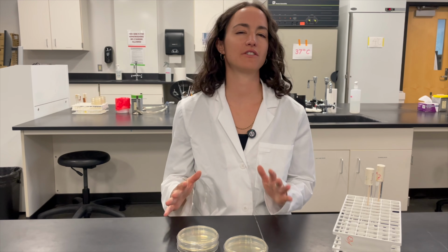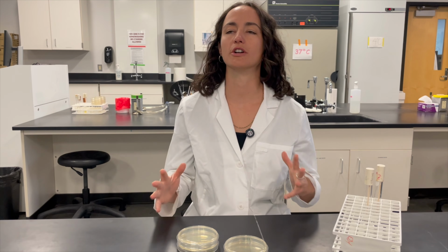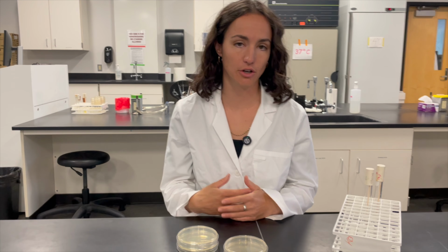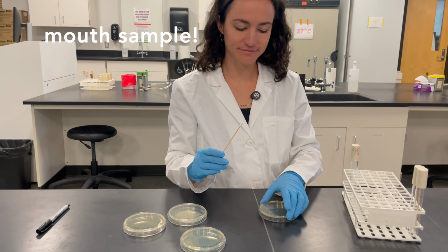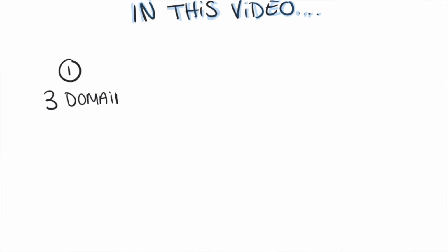However, to the general public, they often get a bad reputation, but the world of microbiology is so much larger than just the pathogens or microbes that get us sick. So today we're going to sample the human body and use that as a jumping off point to learn about the microbes that we find there.